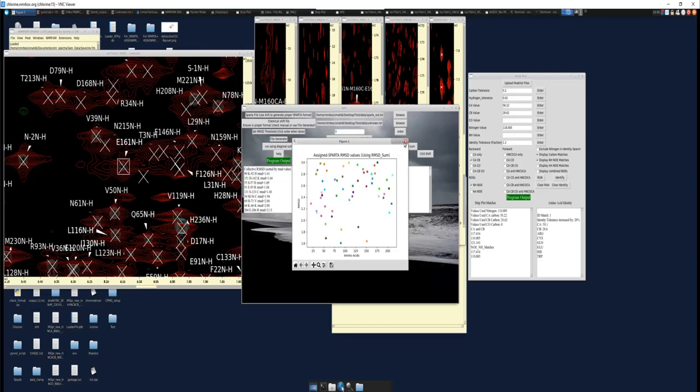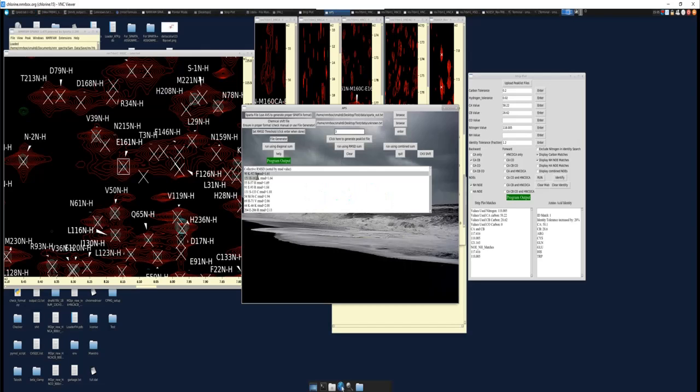So now we have this 90 to 92, 151 to 162, and a couple of other matches as well, right? This is probably a typo, sorry. This should be probably 161. But we know that the last two, right? This amino acid here must be part of this list, right? And so you keep using the strip plot going backwards and backwards to search for your potential matches, right?